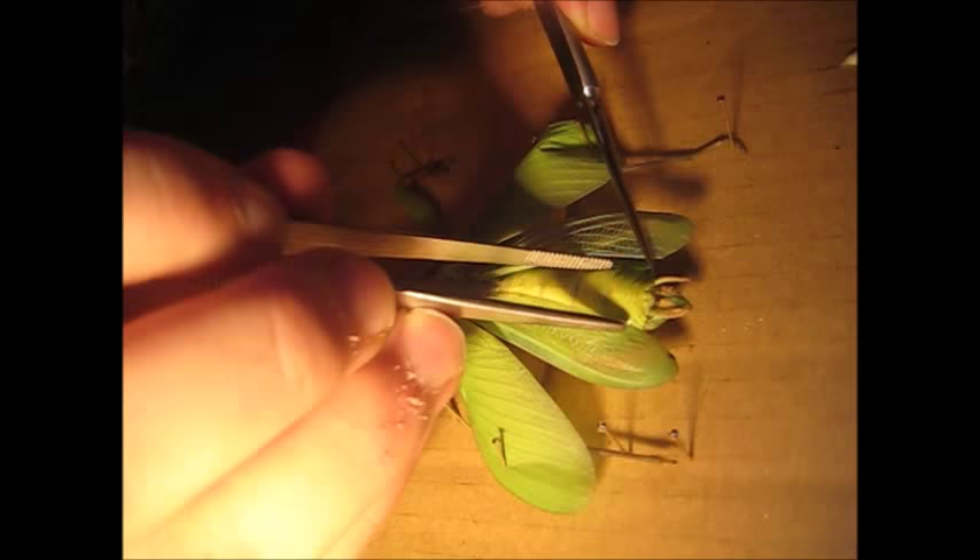If we pull these wings apart, you can see these structures here — two little prongs on the back, segmented. These are called cerci, C-E-R-C-I, and they are used to tell wind direction if the mantis needs to fly. They mostly fly as a flight response — a fear response in relation to predators.